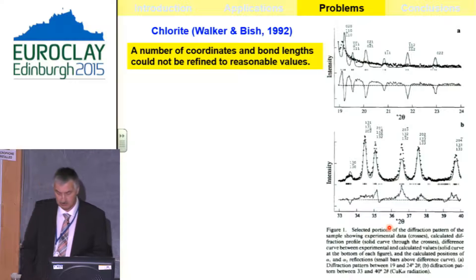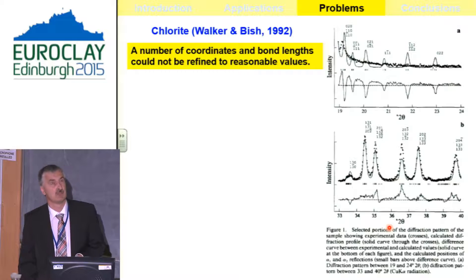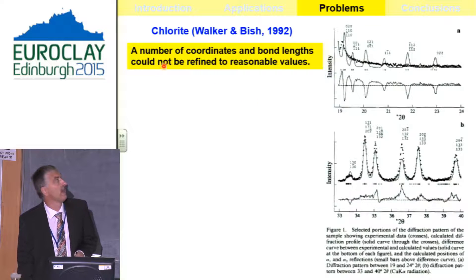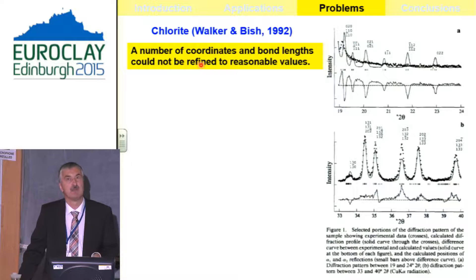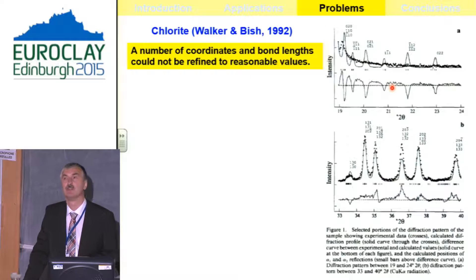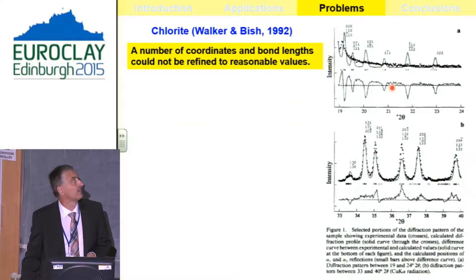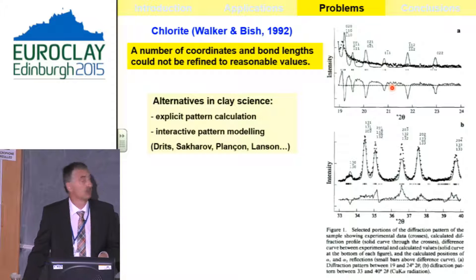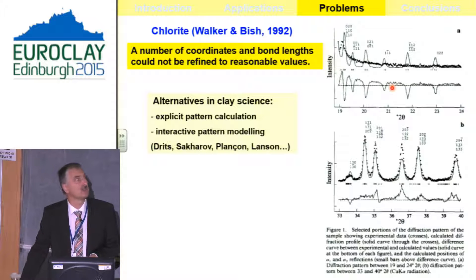Unfortunately, we have some restrictions with structure refinement for clay minerals. One example demonstrated for chlorite shows that a number of coordinates and bond lengths could not be reasonably refined — due to intensity misfit, meaning our peak profile model cannot describe reality and so cannot put intensity on the right structure factors. Fortunately, there are a lot of alternatives in clay science, and the explicit pattern calculation and interactive pattern modeling has mostly contributed to our knowledge about the structure of clay minerals.